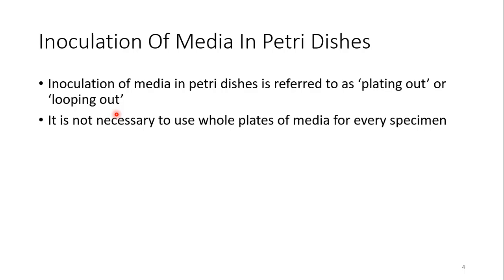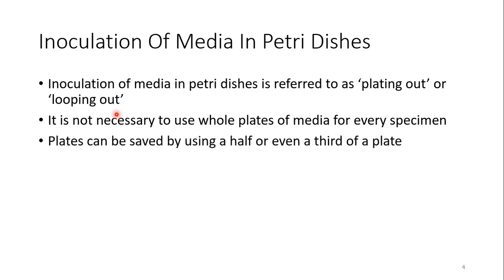It is not necessary to use the whole plate for every specimen; depending on the specimen load, a single plate can be used for more than one specimen, and plates can be saved by using half or even a third of the plate, especially when the media is a selective one and the microorganism is very unique.